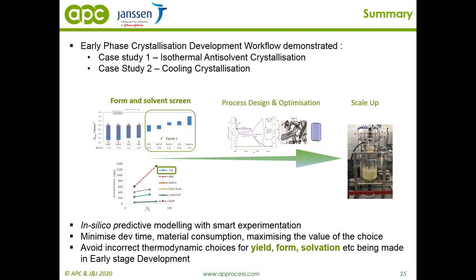A few of our attendees are asking on the same topic: how long does it take to do the computational screening of 70 solvents? The time-consuming part is actually the quantum mechanical calculation, which usually takes about four hours for the molecules, or it can take longer. We had API molecules which took the whole night. But this is just to build that quantum mechanical calculation. Later, the calculations are quite fast, so it can take 20 minutes to 1 hour. If you do an iterative approach, where you also want to include the concentration of the API, I found that when you calculate high solubility it can take a while to converge. So I had cases where it took half a day. Okay.